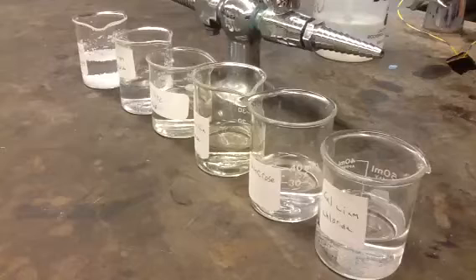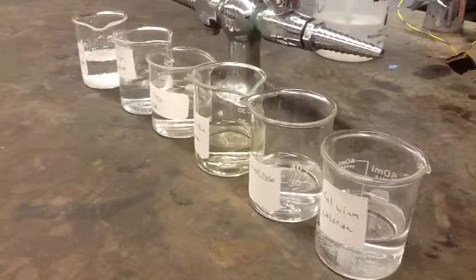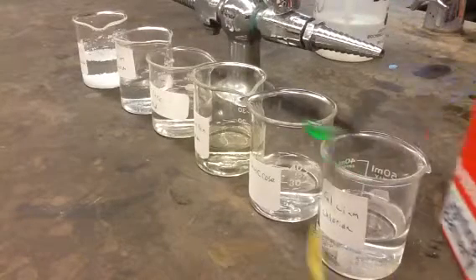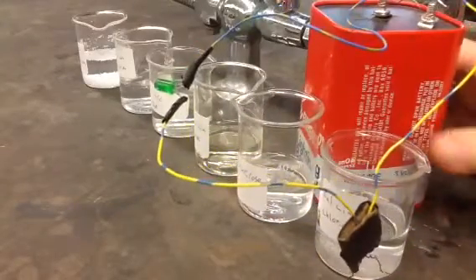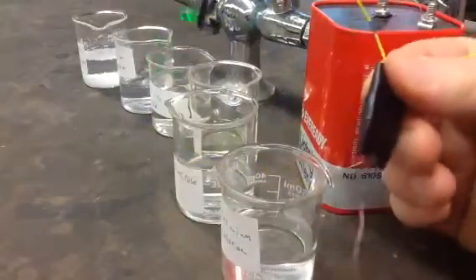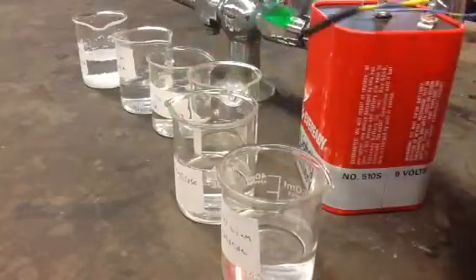This is a conductivity test. We're going to test whether or not a solution of a given substance conducts electrical current. And to do this, we have this very sophisticated conductivity test meter, which is a 6-volt lamp battery, some wires, some little bare ends of the wires, and hooked into the circuit is an LED.